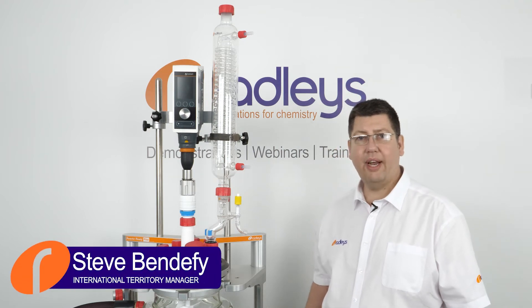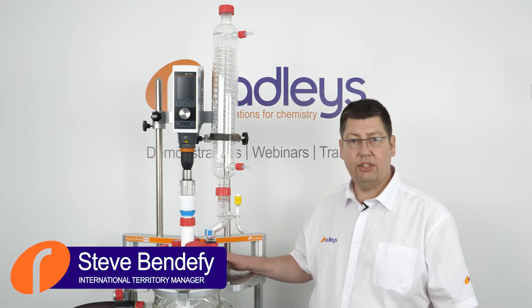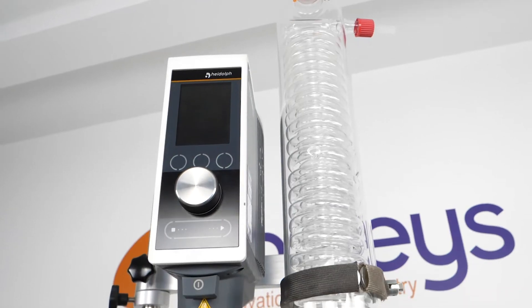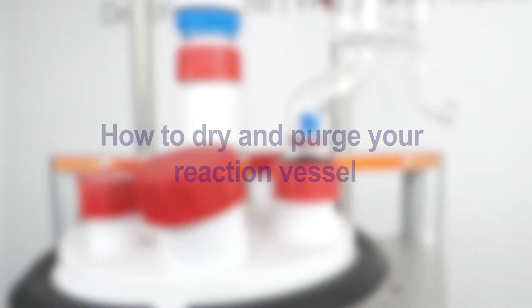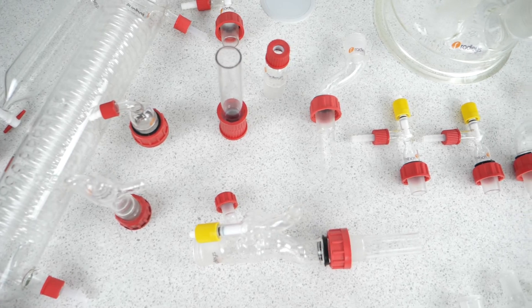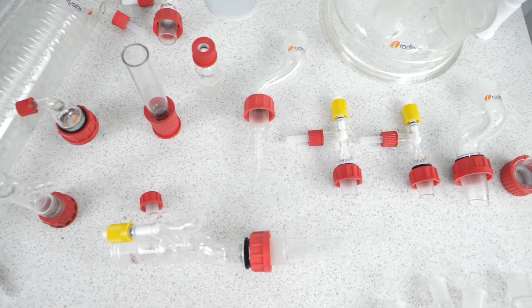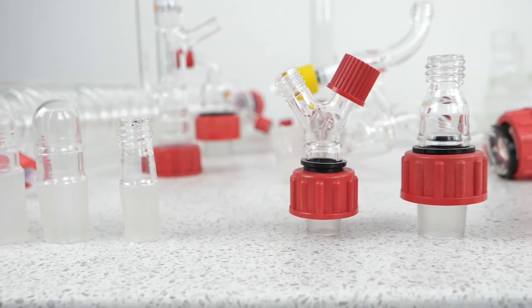Today we're going to look at how to dry a jacketed glass lab reactor in situ prior to use. The traditional way to dry smaller lab glassware prior to doing chemistry is to warm the components in a vacuum oven for several hours.